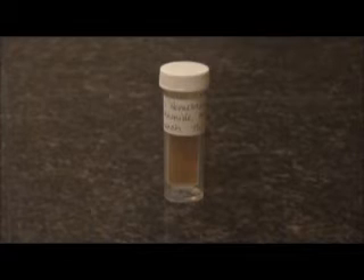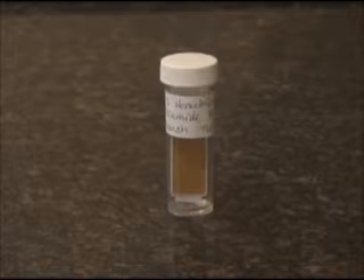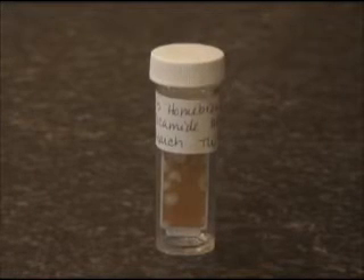The mold colonies did not begin to appear until six days after sampling and appeared almost instantly as a large growth. The final mold picture is after seven days of incubation.